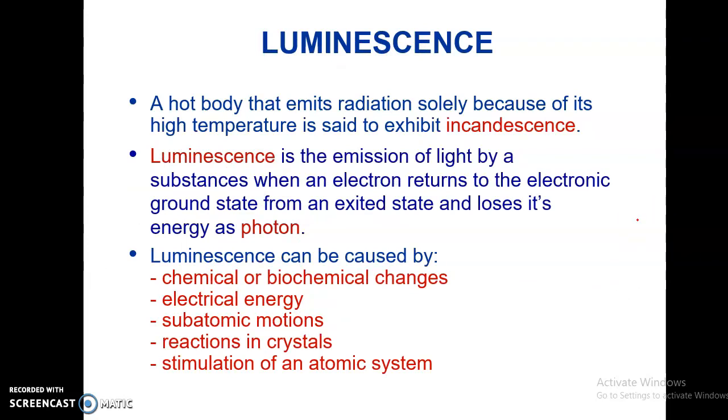So what is luminescence? If you hear it in everyday conversation, you say the sky is illuminating, the stars are luminous, and so on. So what exactly is luminescence? It is happening because of the emission of light. How does the light emit? After the compound returns to the electronic ground state.